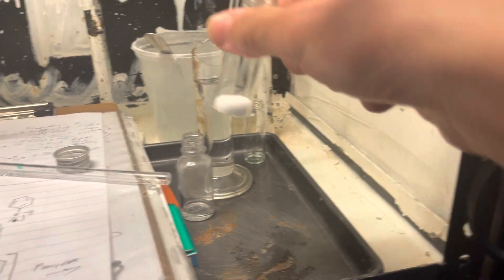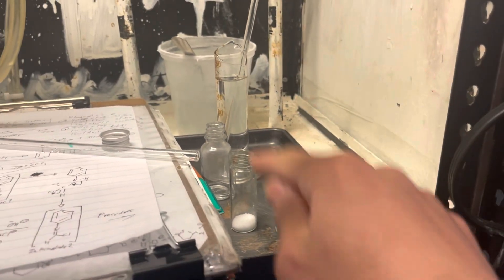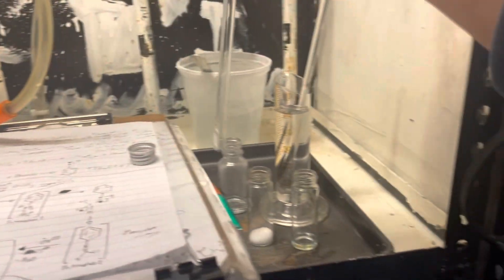The original plan was to make a large batch of this and then distill it down to get the pure phenyl isonitrile, because I wanted to see how bad it could possibly be. But after doing this pilot scale run, it smelled horrible.